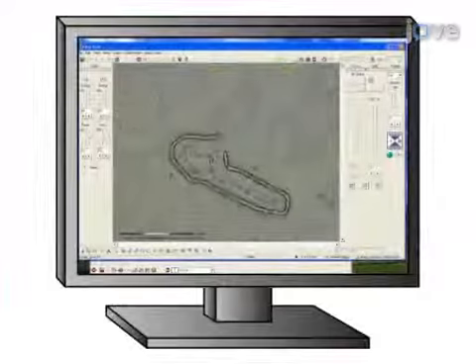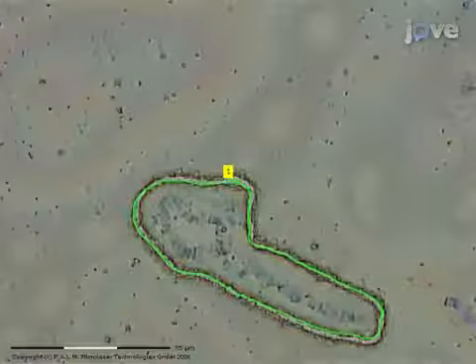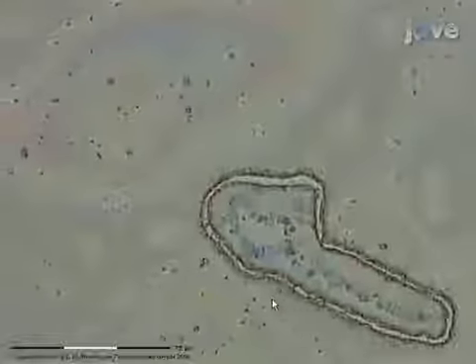This is accomplished by first preparing polytene chromosome squashes on specially designed membrane slides for microdissection. The second step of the procedure is to isolate and capture individual polytene chromosome arms by laser microdissection.